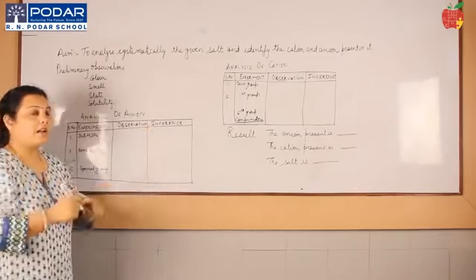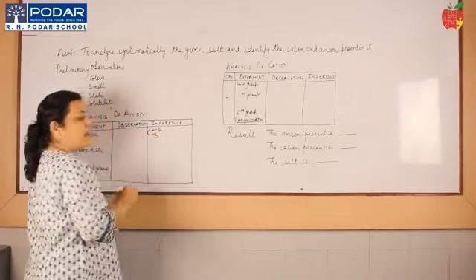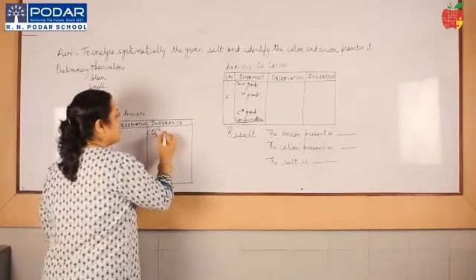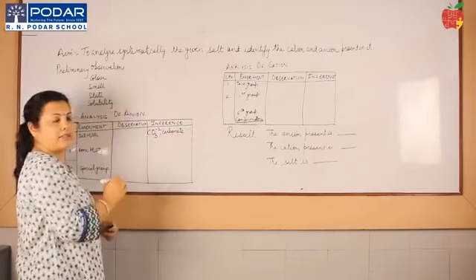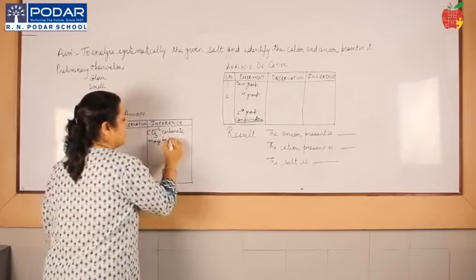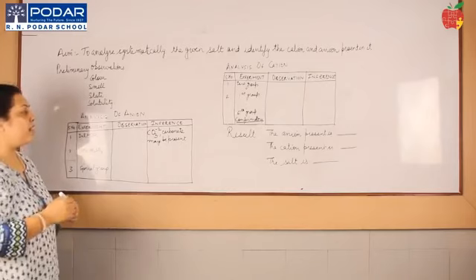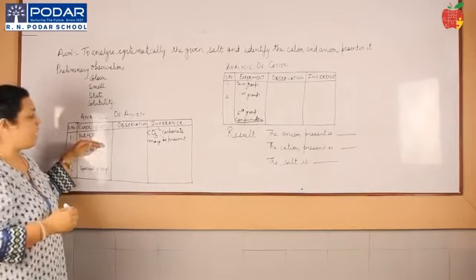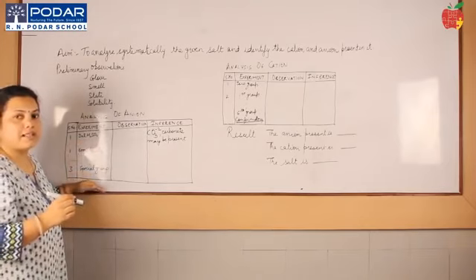Inference would be, now over here it's very important, you will write both the ionic form as well as the name of the radical. Carbonate CO3 2- may be present. Whenever you have your group test, you will write may be present. Now once you have got carbonate, there is no need to write concentrated sulfuric acid and the special group.